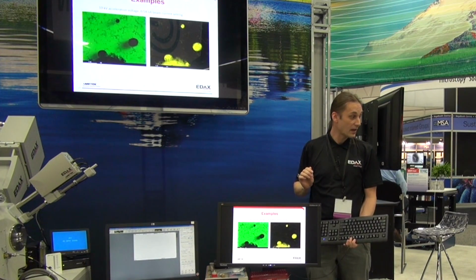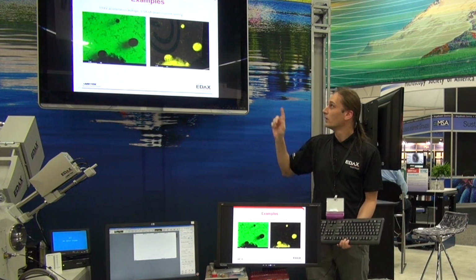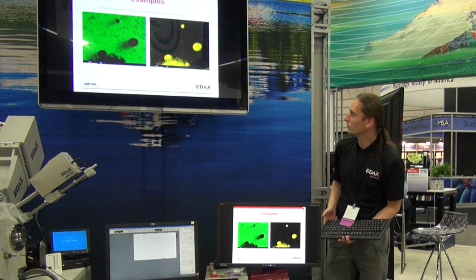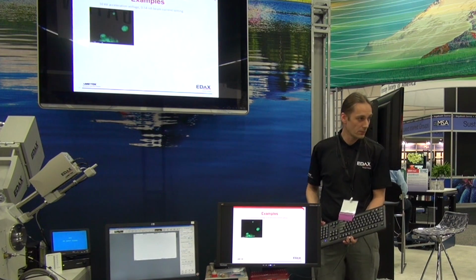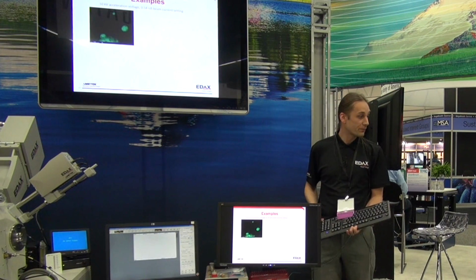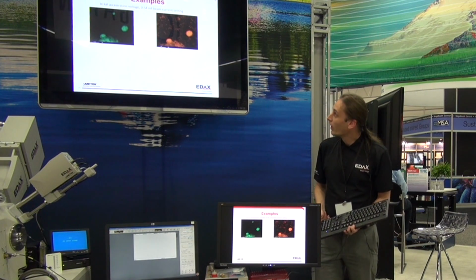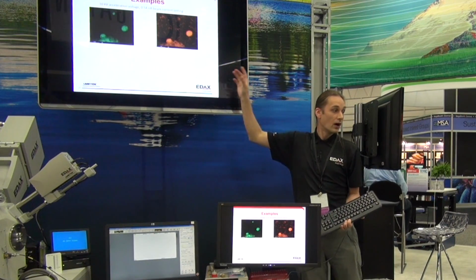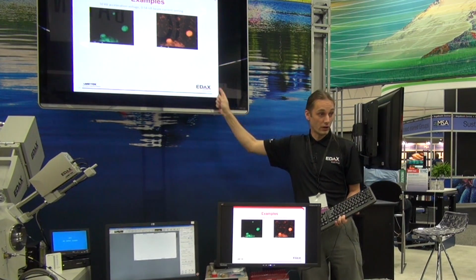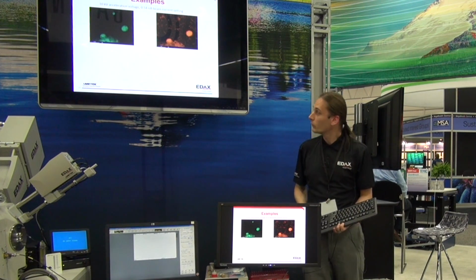You can easily get good high resolution EDS maps. This is at 10 kV. I'm just going to run through some of the other elements we have in there. That's lanthanum. So the larger particles are primarily cerium and lanthanum, the rare earths. We have some iron in there. You can see a lot of the smaller particles are iron rich compared to the larger ones. And again, we have very nice resolution on the small ones here.